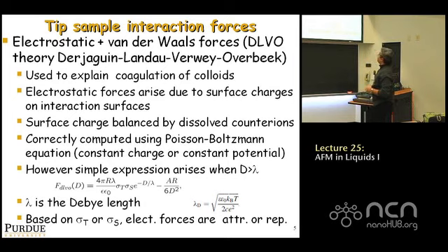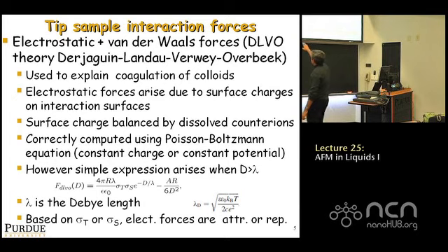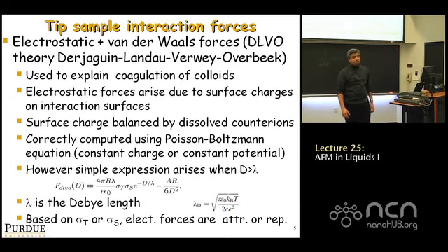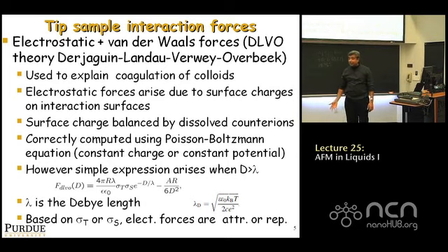You also have van der Waals forces in liquids. It's not that they don't exist; they do exist in liquids also. So the DLVO interactions, for example, as stated here, would suggest that the interaction force between a spherical tip and a flat surface is given by the following formula. The latter part of this is the attractive van der Waals force that we have talked about before.